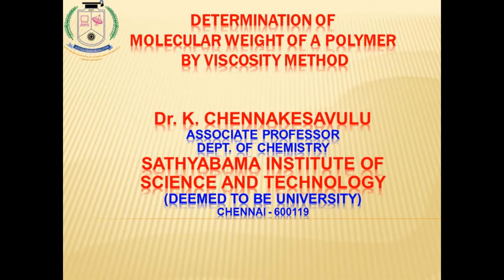Before going to discuss this experiment, we should first know what polyvinyl alcohol is. Vinyl alcohol means a double bond which is attached to OH. That is the monomeric unit. If you polymerize the vinyl alcohol, you get polyvinyl alcohol.